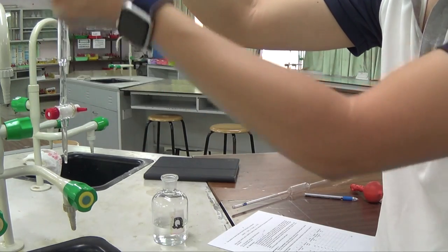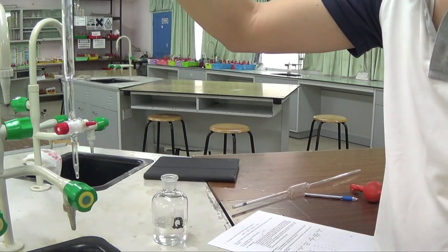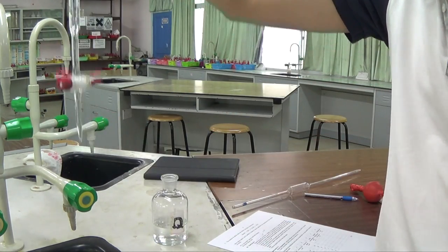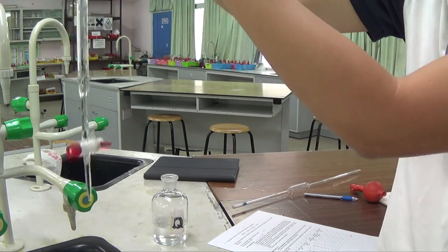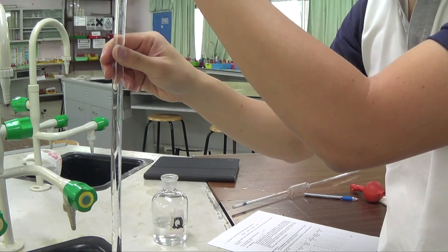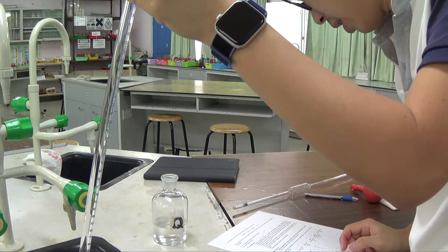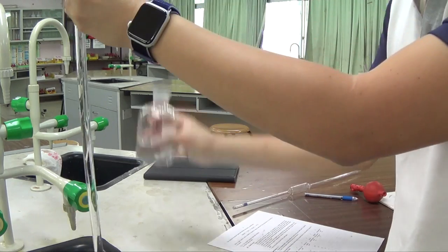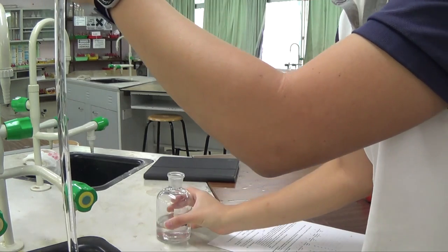Whatever flows through was the good stuff, and it has already washed out whatever I rinsed it with, the very last bit that was remaining in there. I already opened the tap, so this is filled in all the way to the top. They do not say it has to start at 0.00, but I'll probably make my life easy and just fill it up to 0.00.